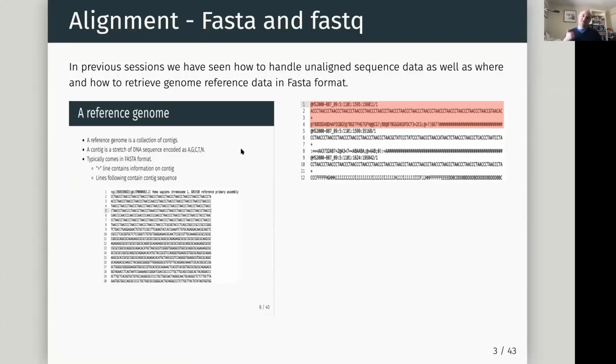Okay, so in the very beginning, we said FASTA is the format that we store reference genomes in. We saw here as an example the GRCh38, the latest human genome build, and we're going to have more conversations about genomes and genome builds later when we have our PacBio talk by the VGL group 2 weeks from now.